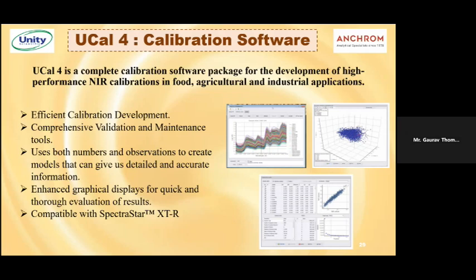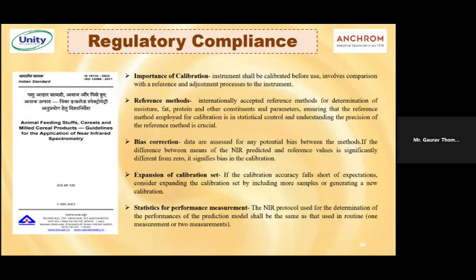Yes, it follows ISO 12099. This ISO 12099 talks about the use of NIR spectroscopy in analysis of different samples. Here it talks about analyzing animal feed samples, cereals, milled products, and all these different samples. When you are analyzing all these different samples, what is the importance of calibration? How your instrument needs to be calibrated, and the reference method.